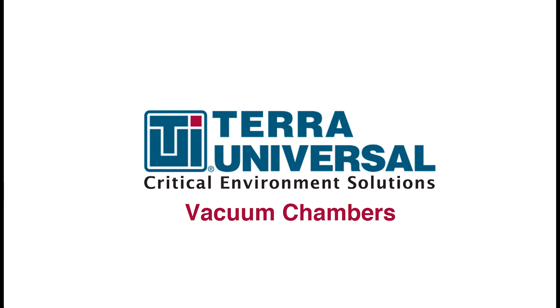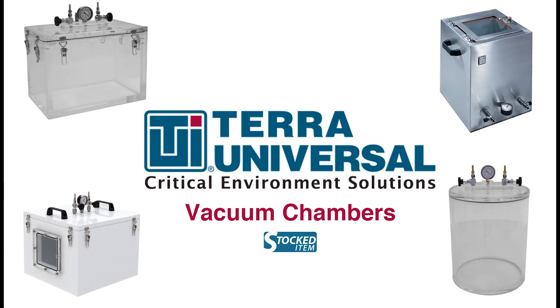Welcome to Terra Universal's informative guide to vacuum chambers. In this video, we will show how to operate a full vacuum configuration and discuss the chamber materials and accessories Terra Universal offers.